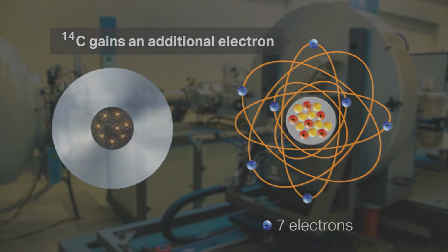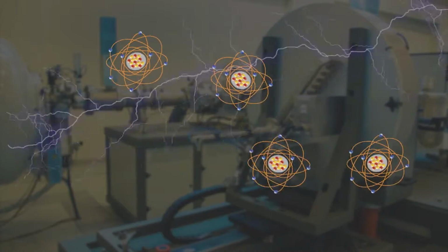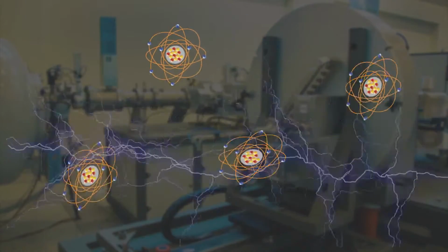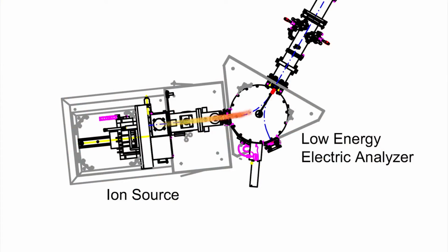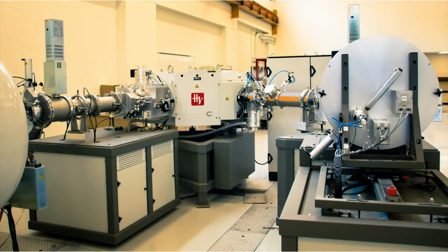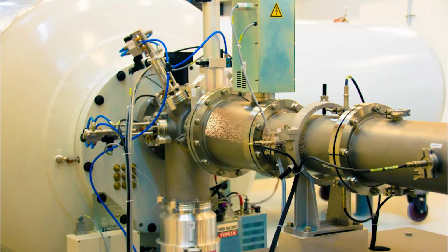Once you get things ionized, you can move them, because we use electrical fields, voltage gradients, and magnetic fields to move these ions around. So we're going to create an ion beam, a beam of carbon racing out of our source. We bend that beam around with magnets and electrostatic devices and aim it into a big tank.